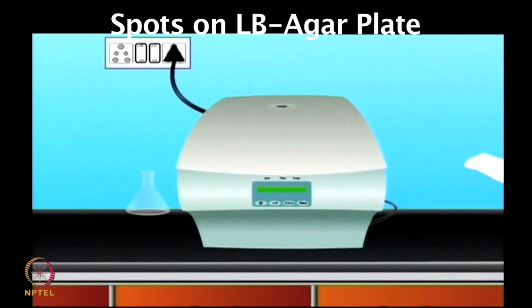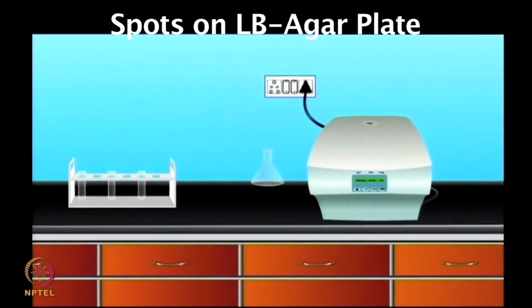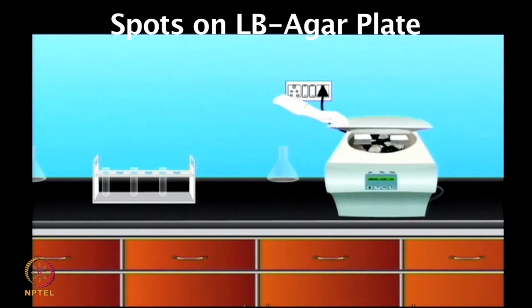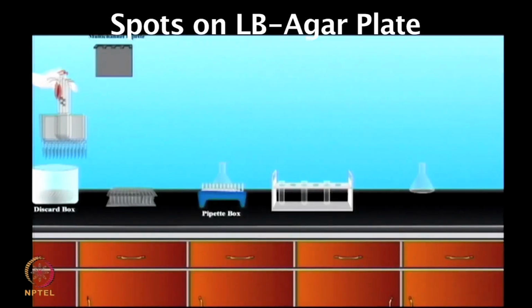Once the centrifugation is complete, the bacterial pellet will be in the well, and then you need to remove the supernatant. So, remove the supernatant from these bacterial cultures.